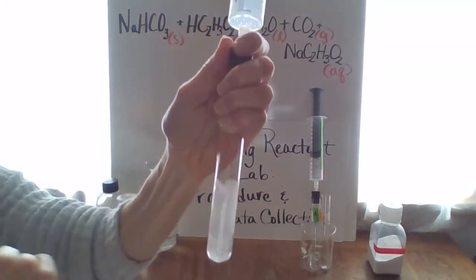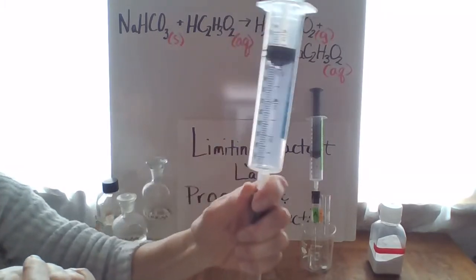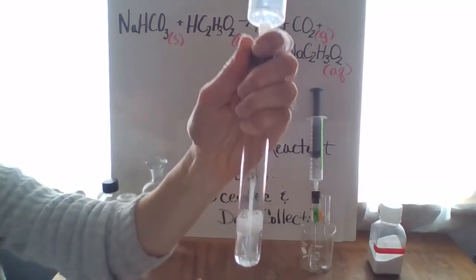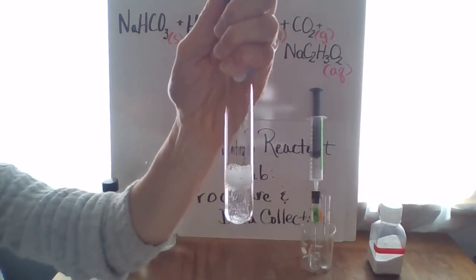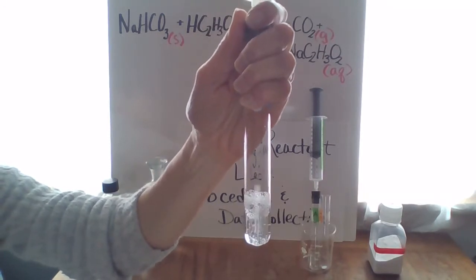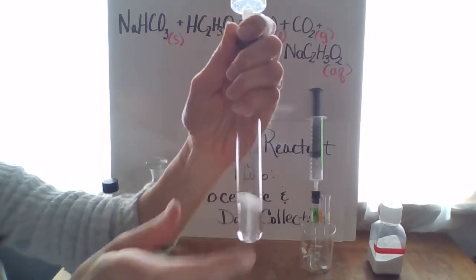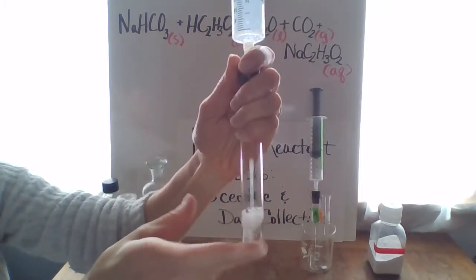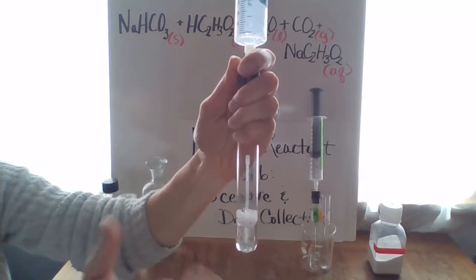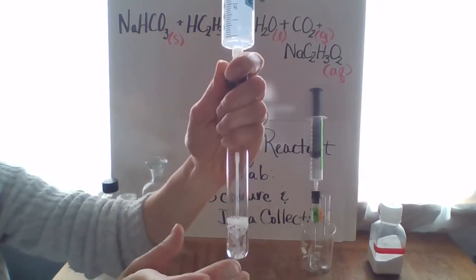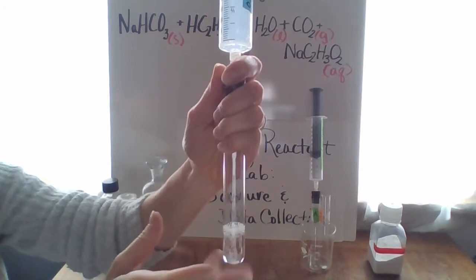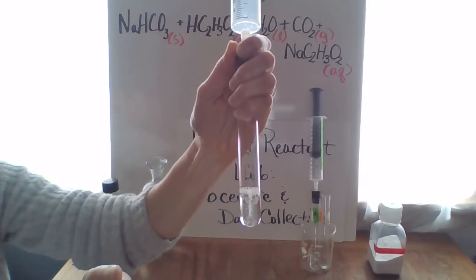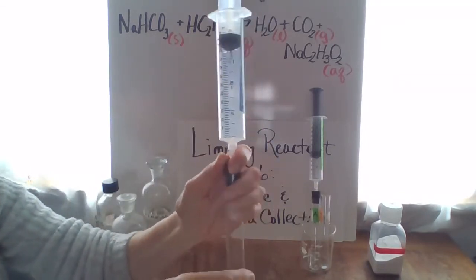Again, it feels cold. You can see that we are getting quite a bit of gas produced. I'm keeping the seal there so you can see your reaction taking place. Almost finished bubbling. We can see quite a bit of gas produced there.